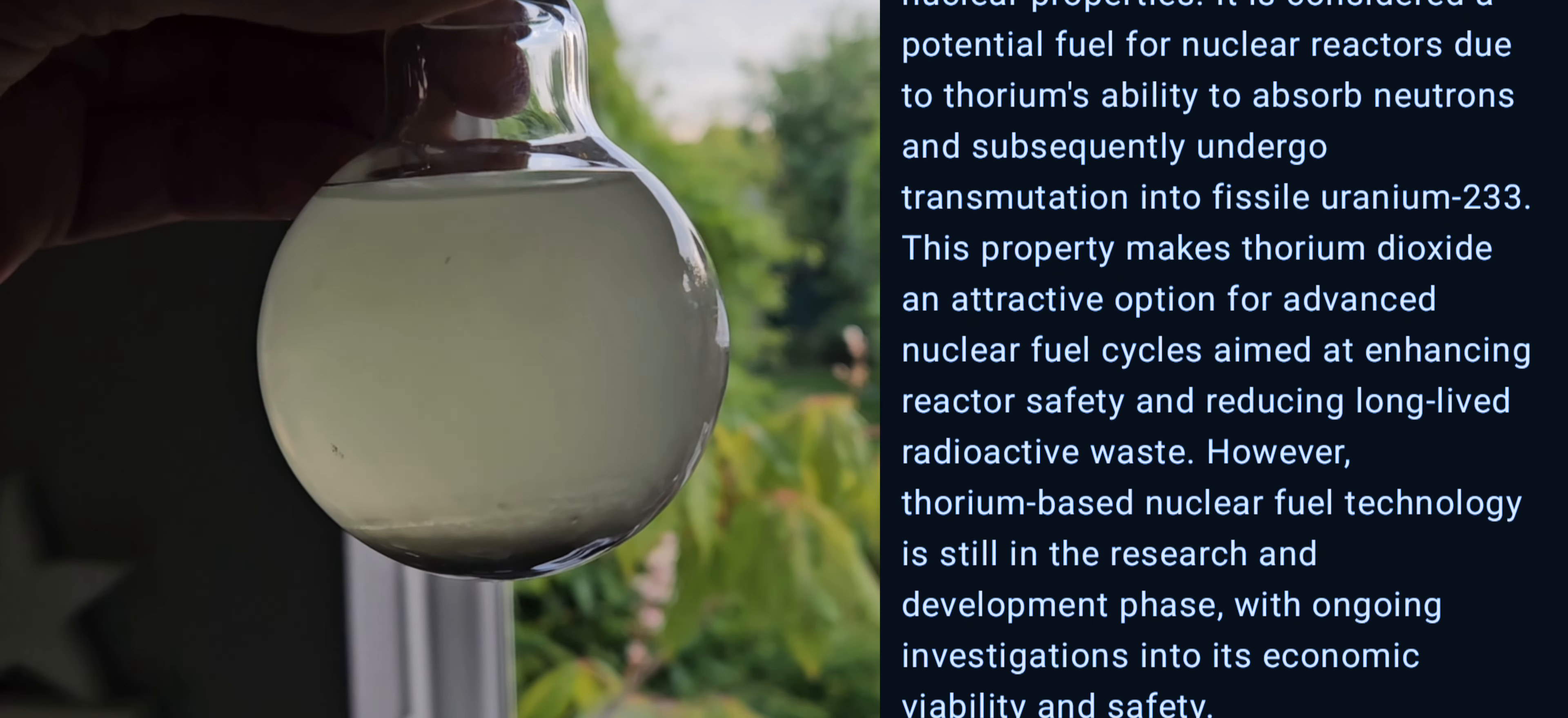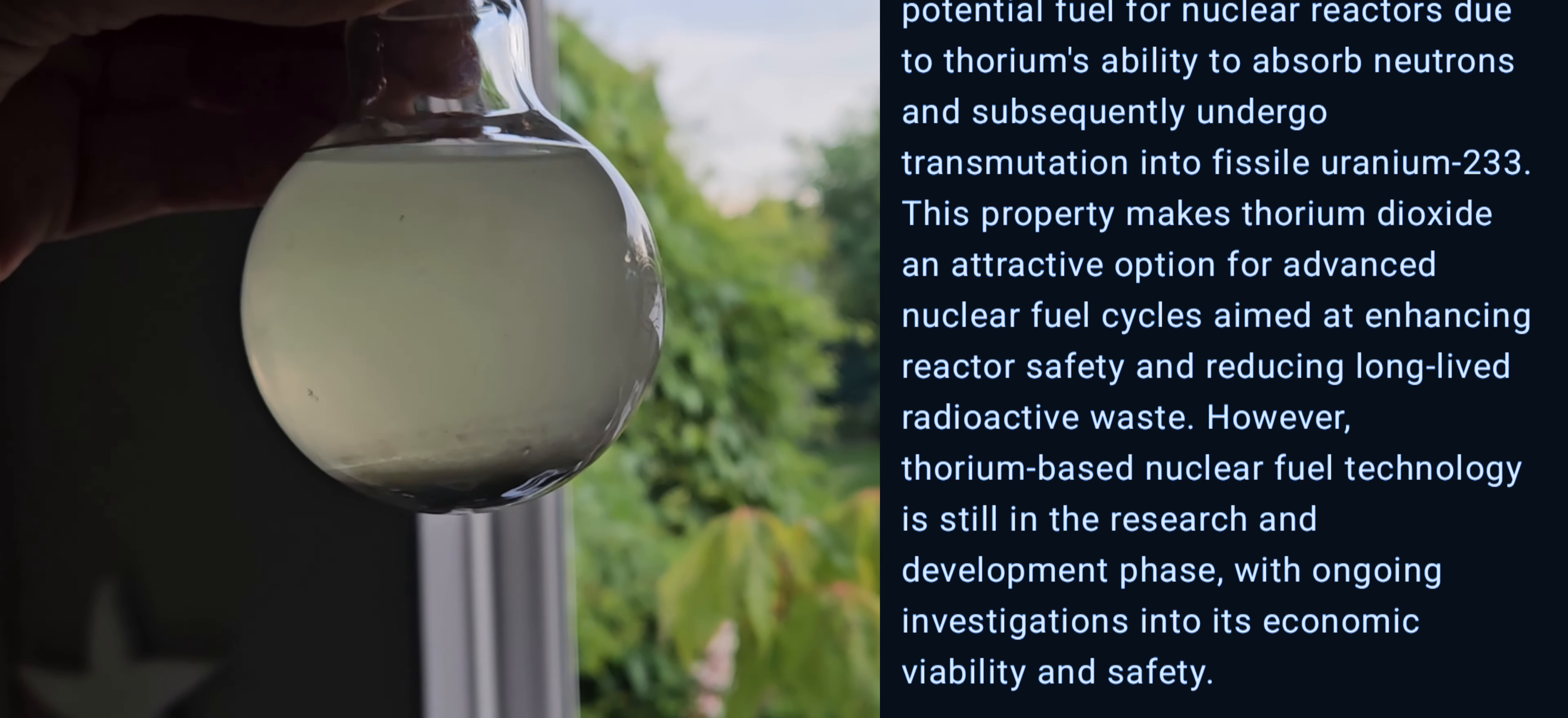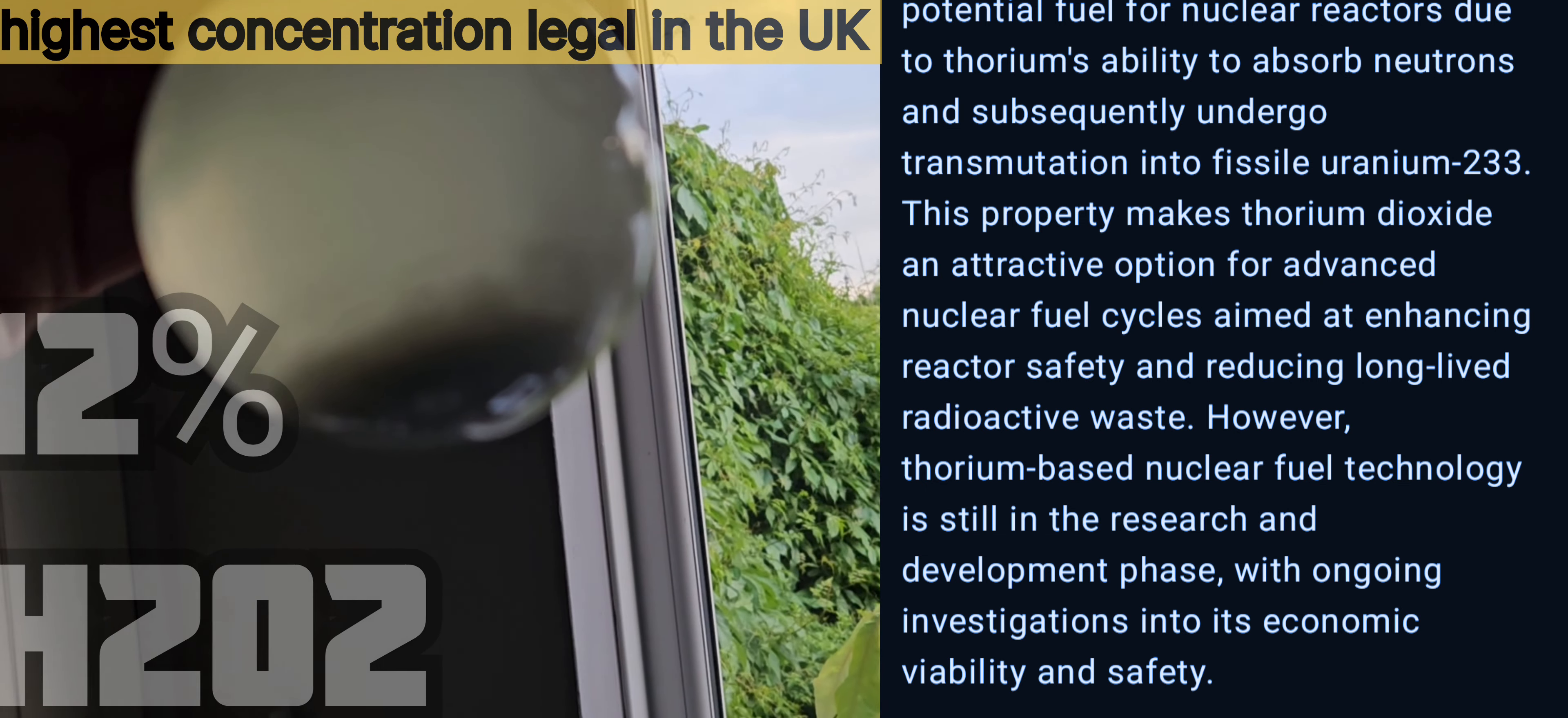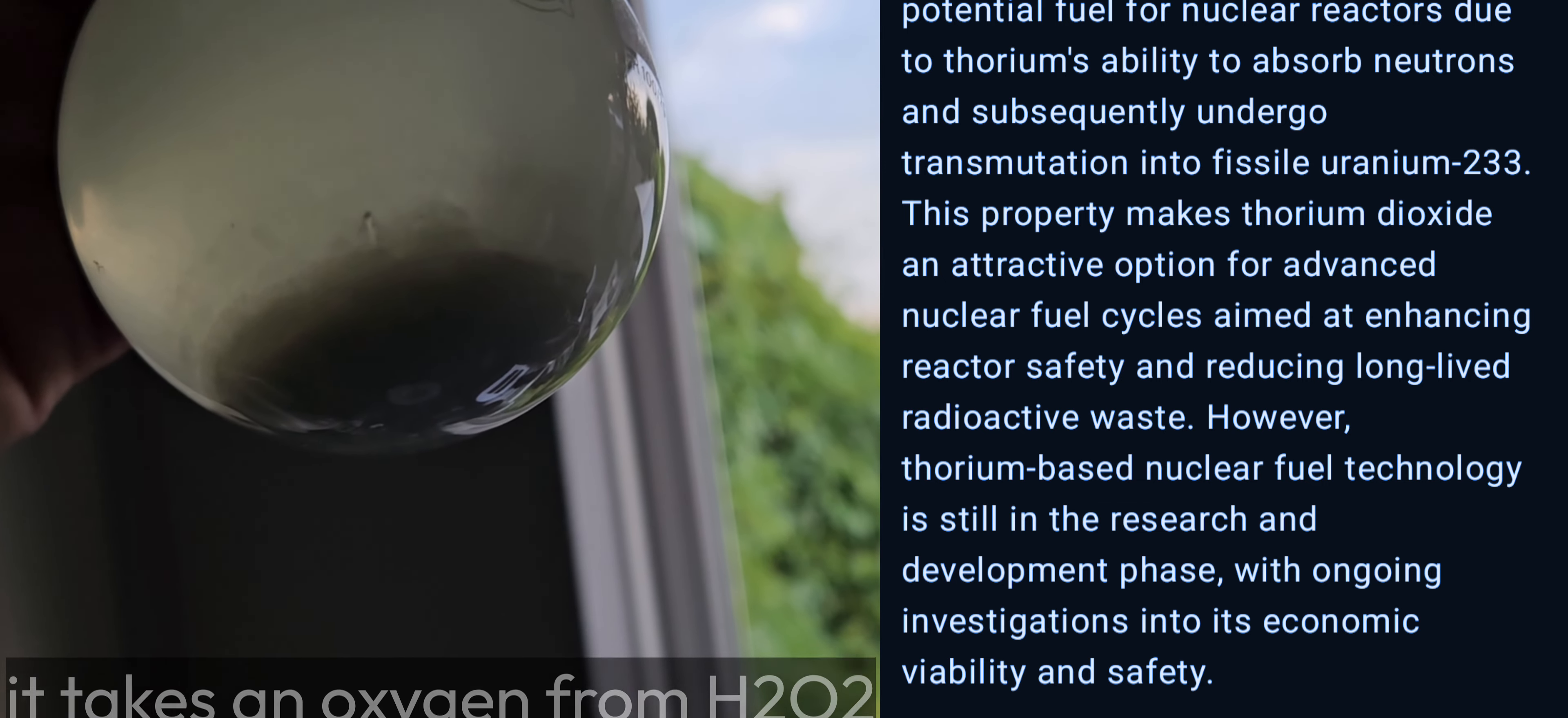This was obtained from two percent thoreated tungsten welding electrodes which have been sitting in hydrogen peroxide for several weeks. The tungsten dissolves and the thorium becomes thorium dioxide which is insoluble.